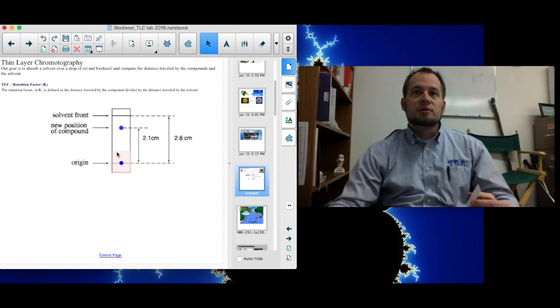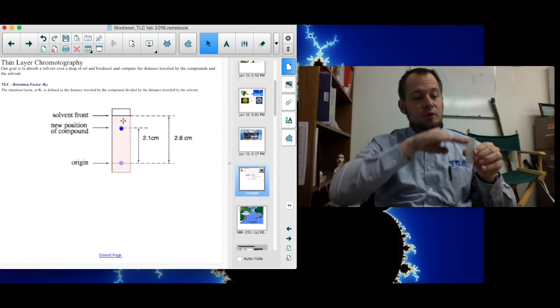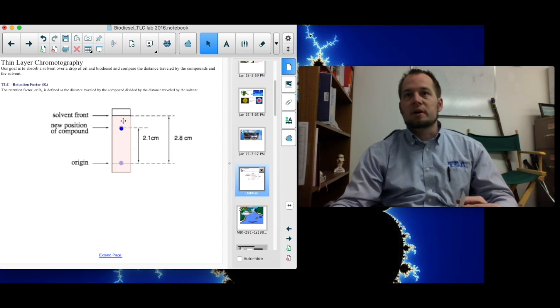So a couple of terms to define. Your origin is a line at the bottom. That's where you put your first initial spot. Then as the solvent travels up, kind of like that, the solvent front is the furthest that the liquid travels up. So that's going to be at the top. And then the new position of the compound is that new little spot there.